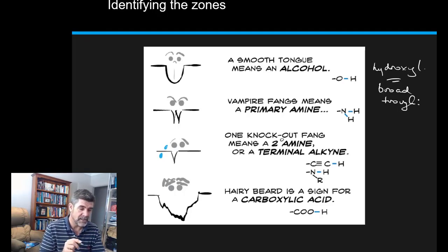But just make sure that you identify where those are located, the particular shape that tells you that it is a carboxylic acid or it is an alcohol. And usually using that sort of data, we can go from there to construct some evidence for what it is that we've concluded is the identity of a molecule.